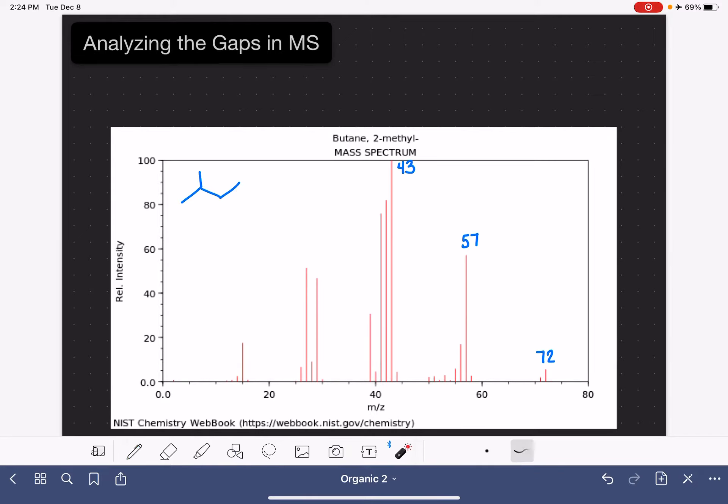And then I've got another cluster over here. It looks like I've got two pretty prominent peaks in this area. This is 26, 27, and then also 29. And then I've got this one little peak down here at 15.